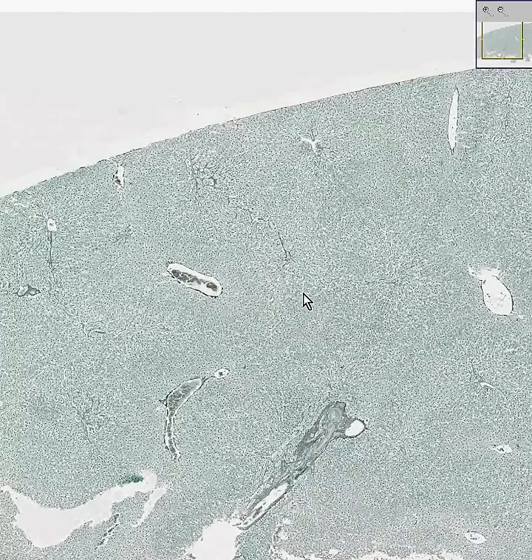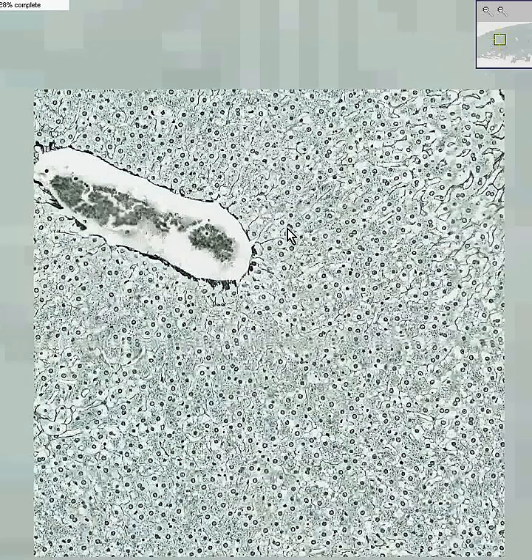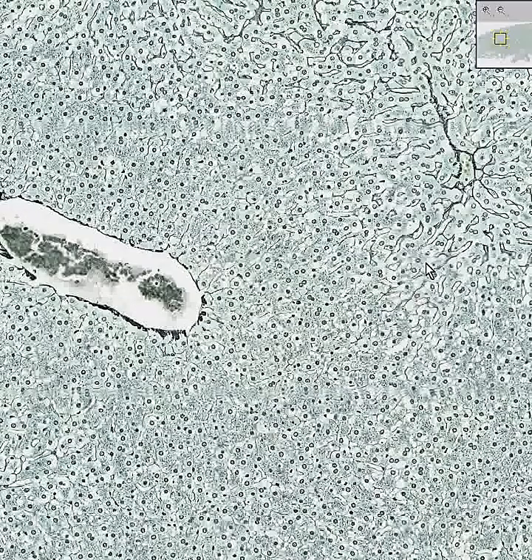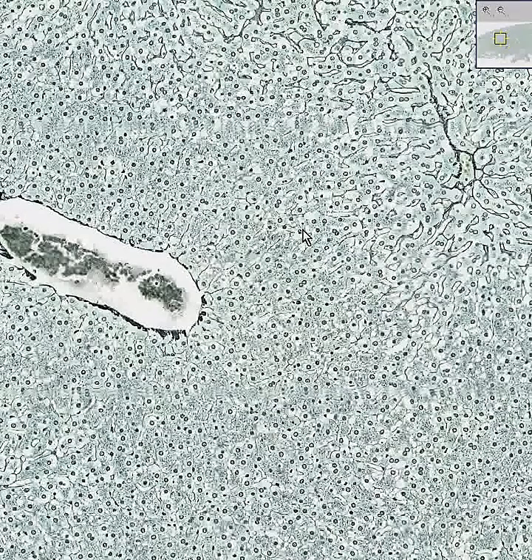Well, that's not really true, because there is a very fine delicate network of reticulin fibers which are throughout the liver, and they basically come in contact with just about every hepatocyte.